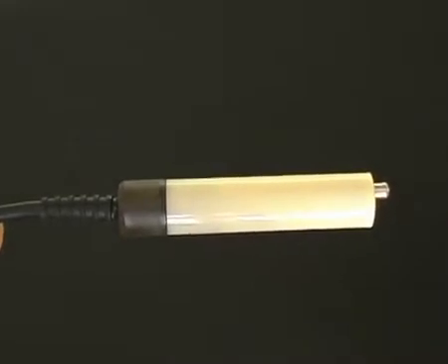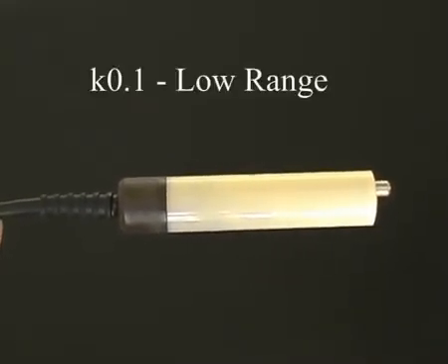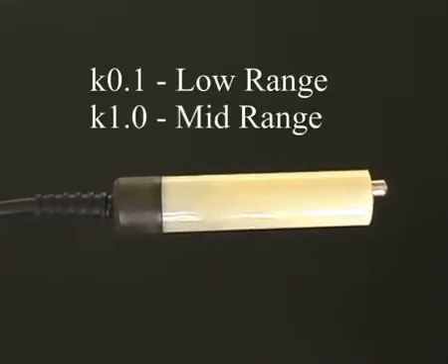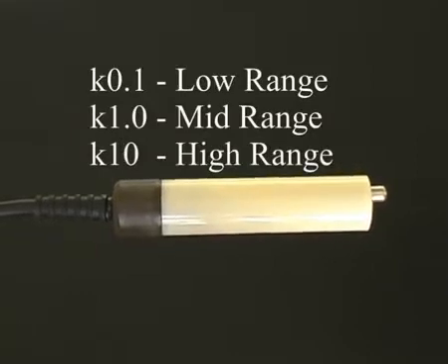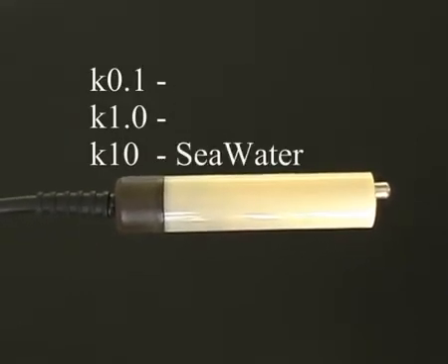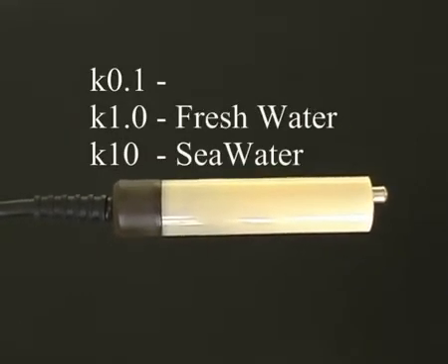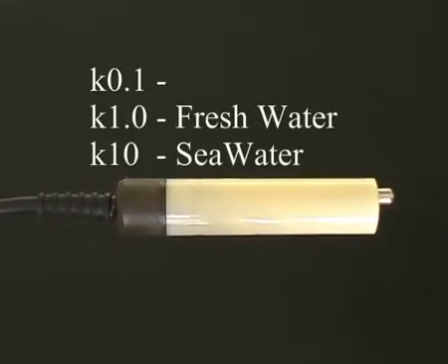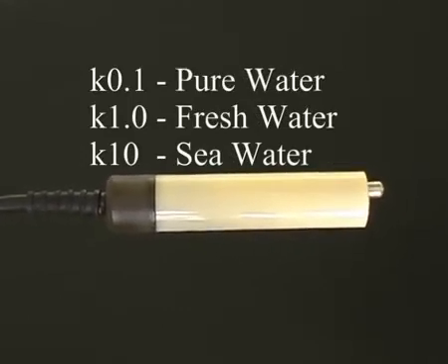Conductivity sensors are available in three ranges: K.1 low range, K1 mid-range, and K10 high-range. The K10 is used for seawater, the K1 is used for freshwater, and the K.1 is used for pure water.